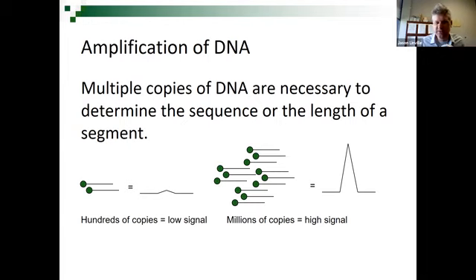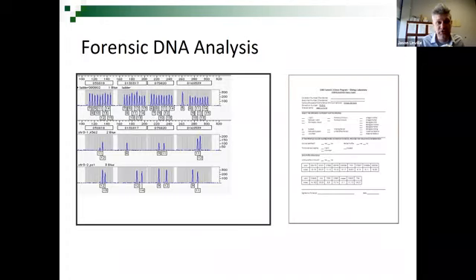That's why amplifying the DNA is such an important step. And there are other reasons as well, as far as you amplify the area you want, and then the other stuff that's there doesn't really matter too much. But we can't just chop up our DNA. I mean, that used to be how they did DNA analysis. They would extract it, chop it up, smear it out, and label it with a probe and try to measure the DNA that way. It's very difficult to do if you have an evidence sample that does not have that much DNA in it. So this amplification just makes it a lot easier to measure the DNA.